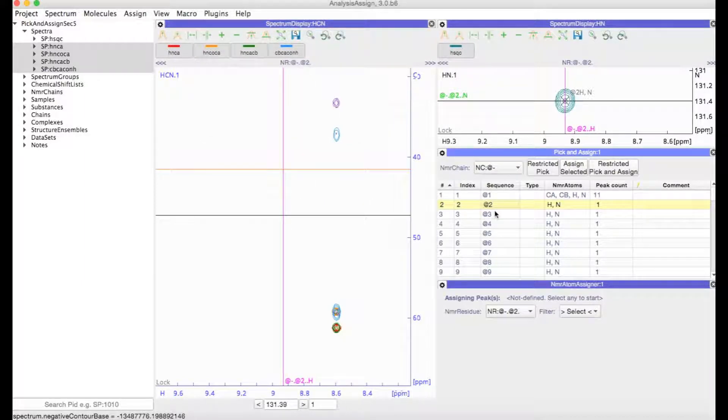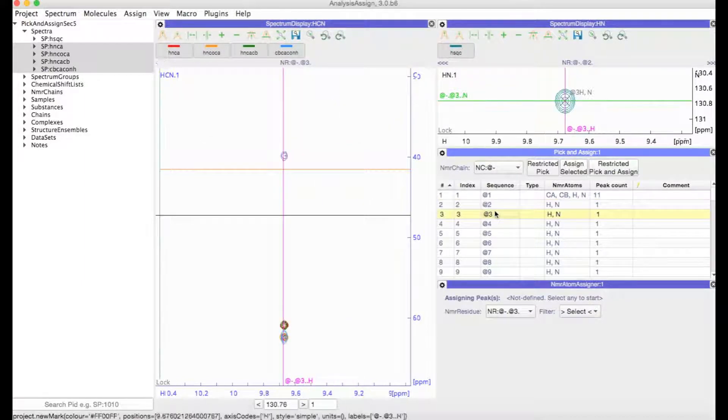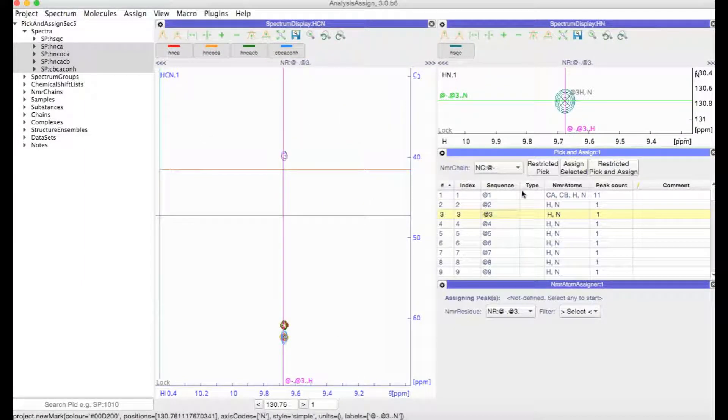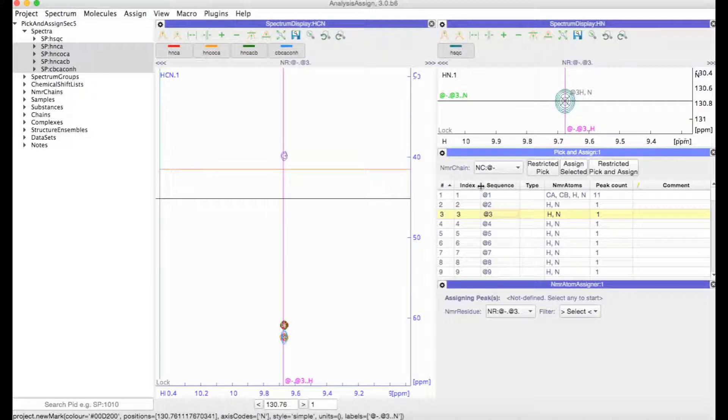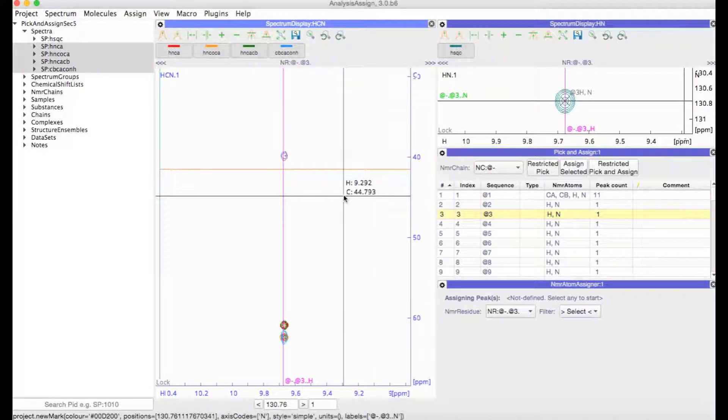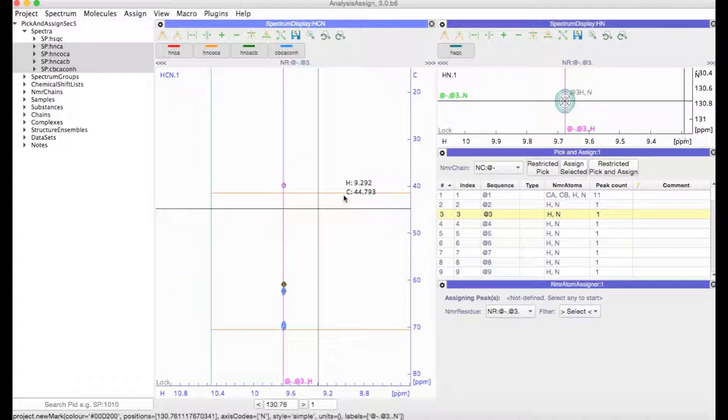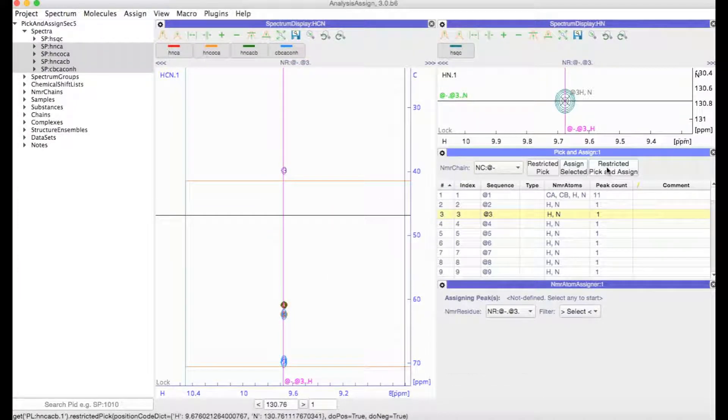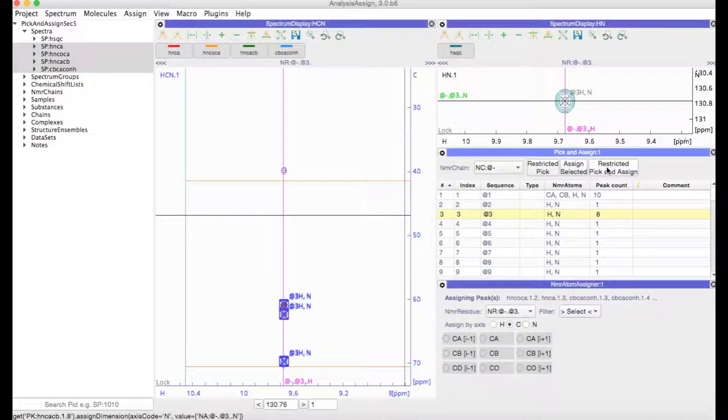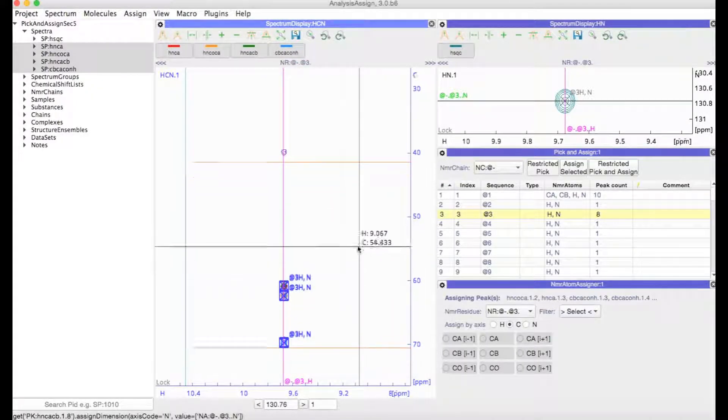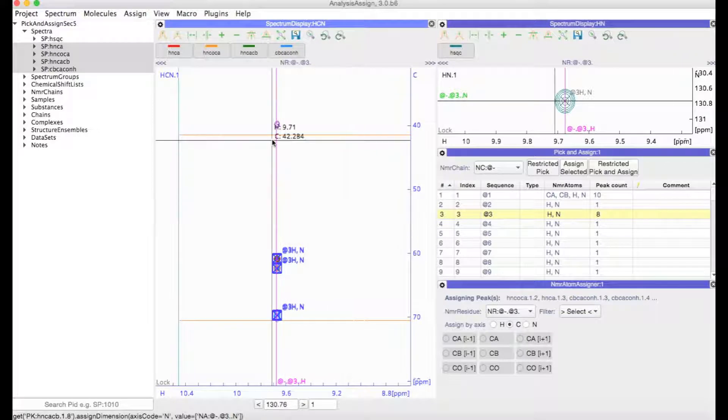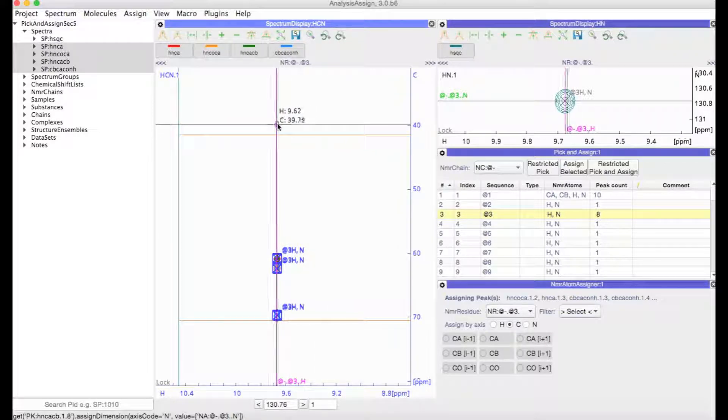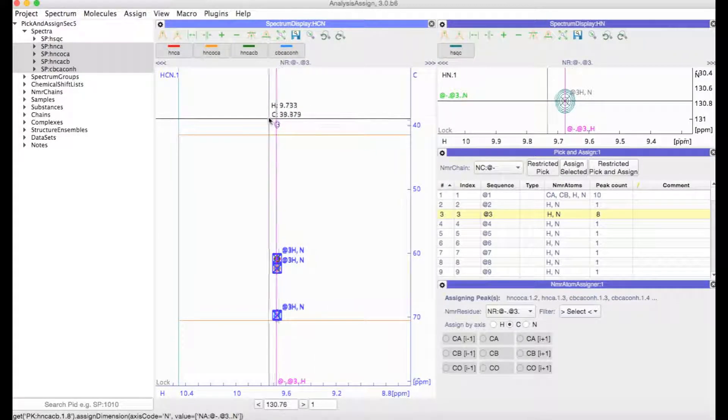So we can just move on to the next one. Now rather than separately clicking on restricted peak and then assign selected, we can do all of that just in one go by clicking on restricted peak and assign. You can see here this peak is just slightly off, so it hasn't picked it.